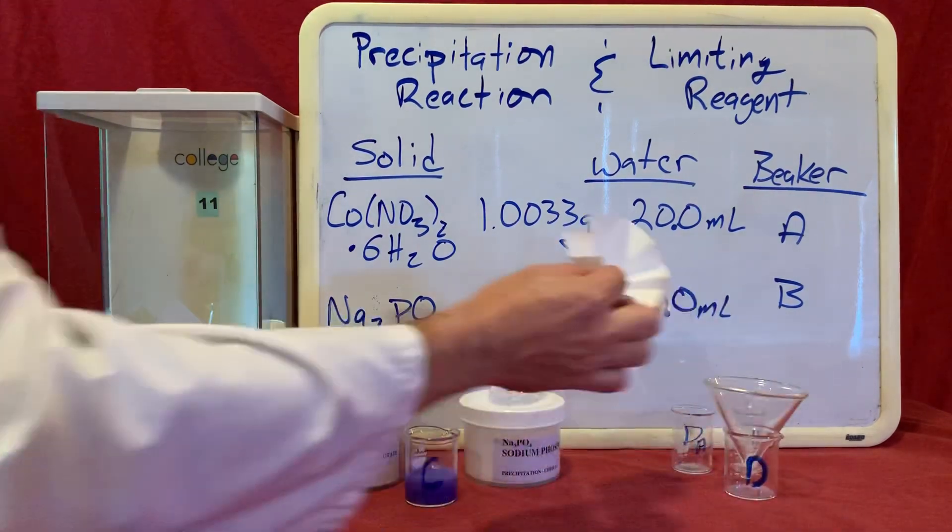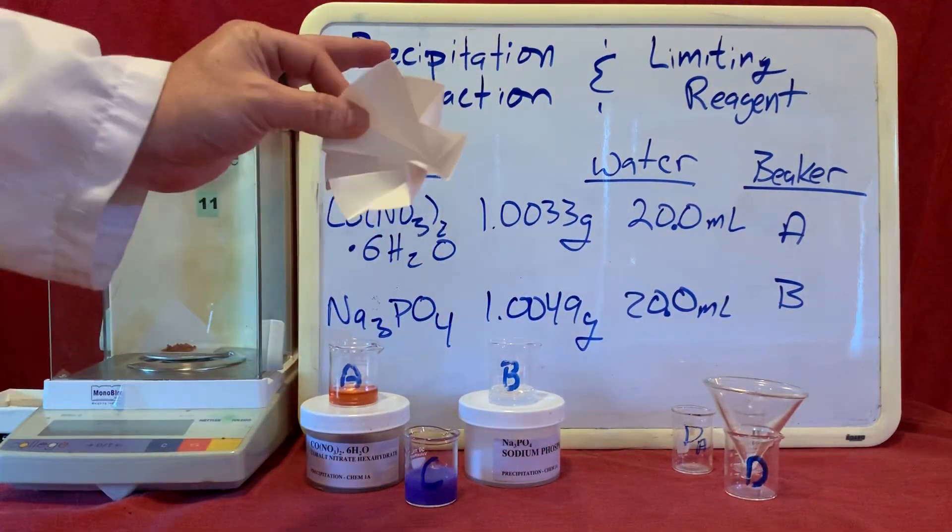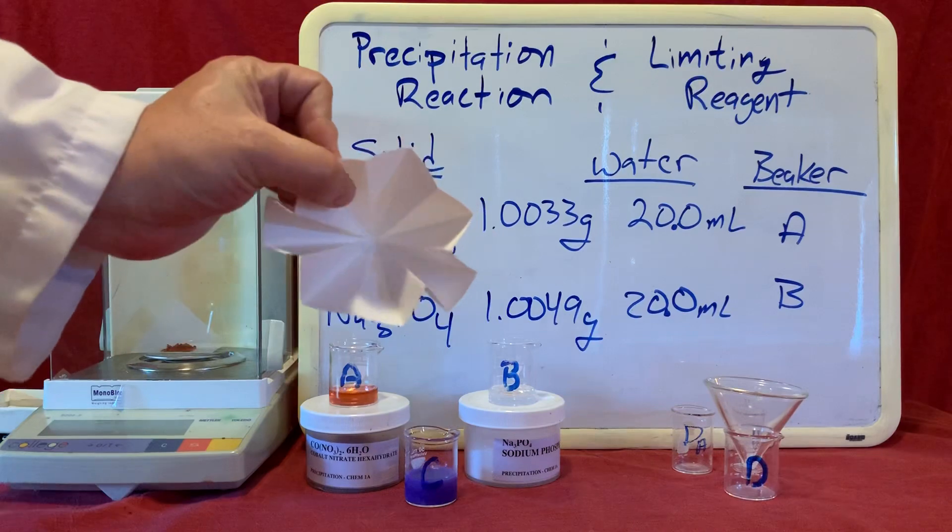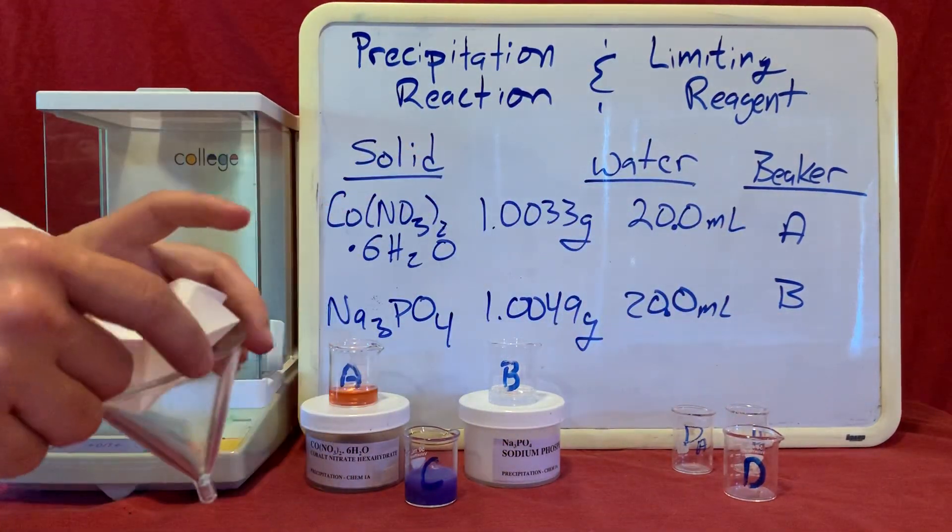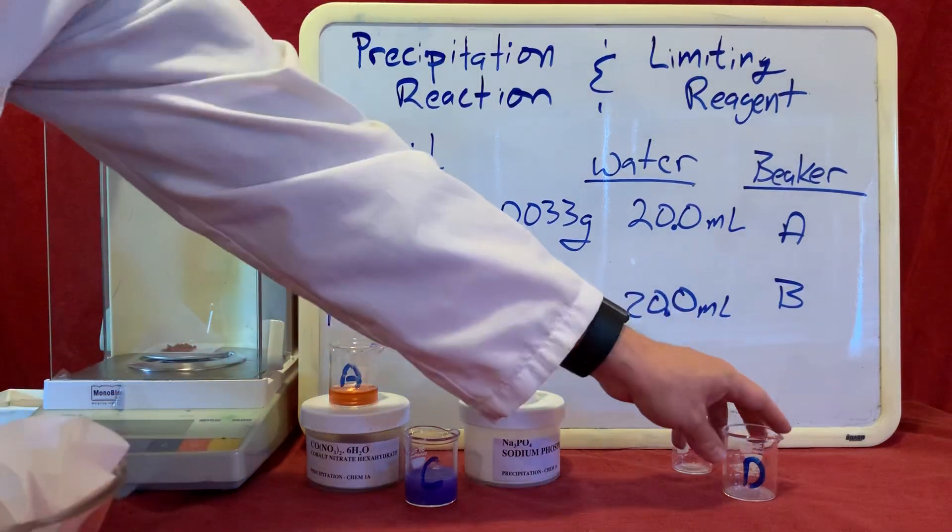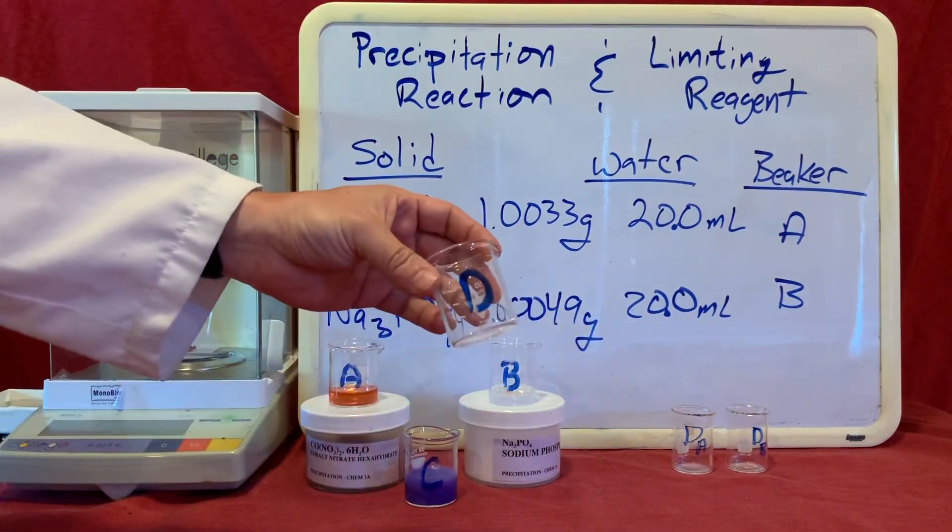I'm going to take a piece of fluted filter paper, which is just a flat piece of filter paper that's been folded up, a funnel, and an additional beaker, which we're going to call beaker D.